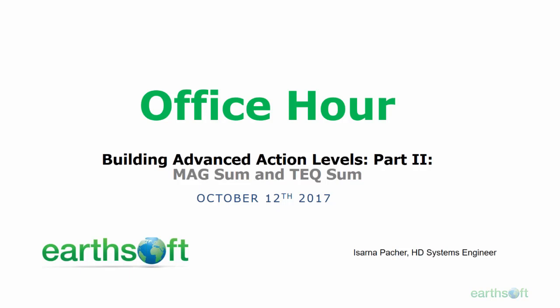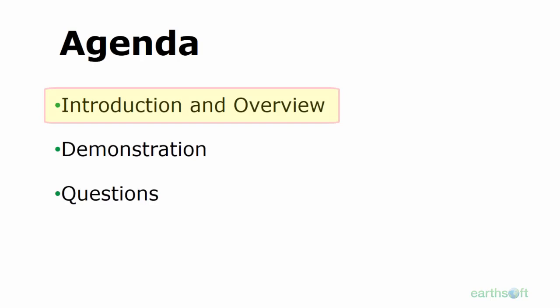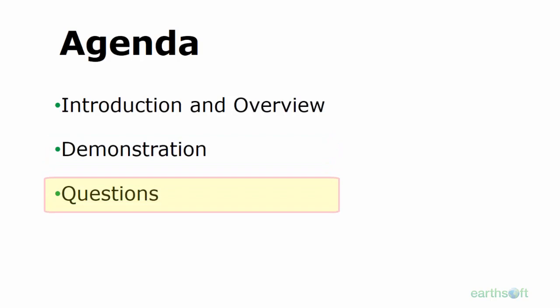Today I'm going to be presenting on building advanced action levels, particularly focusing on the MAG and TEQ SUM. I'm going to give you guys an overview of the MAG and TEQ SUM action levels, followed by a demonstration. And then at the end of the presentation, Jim or I will answer any questions you may have.